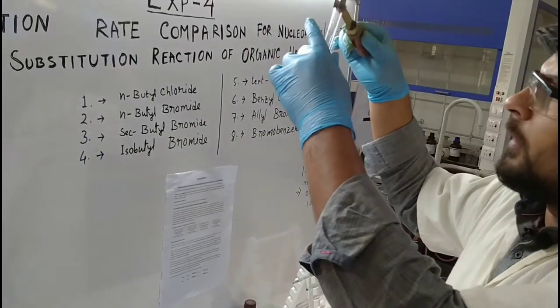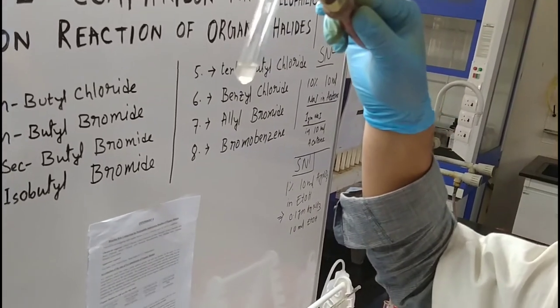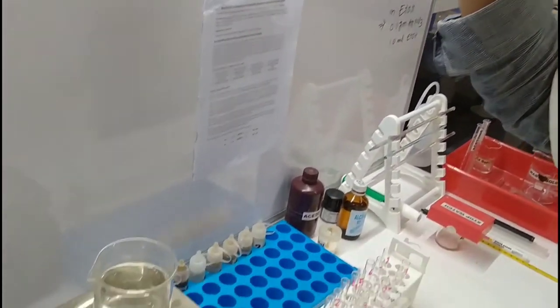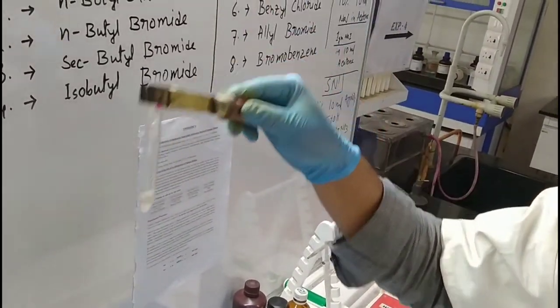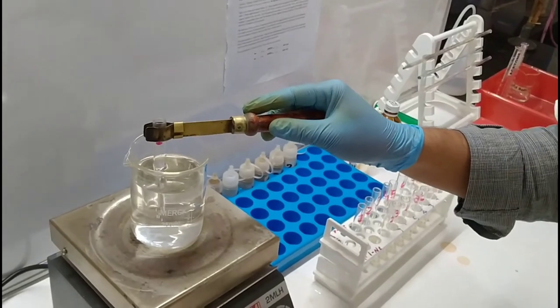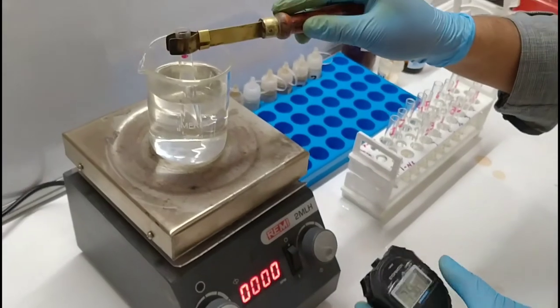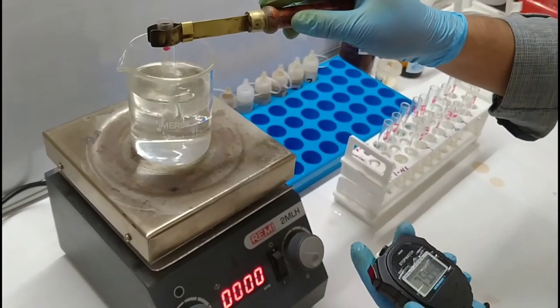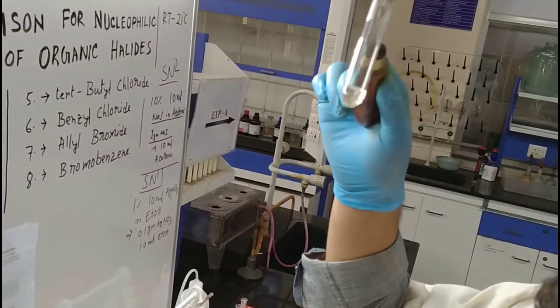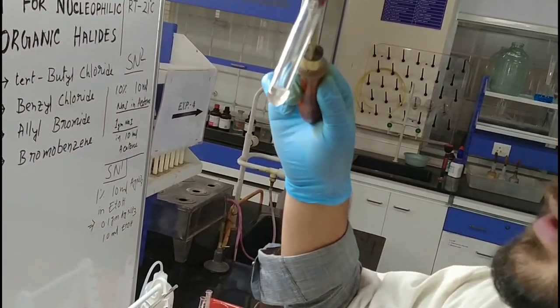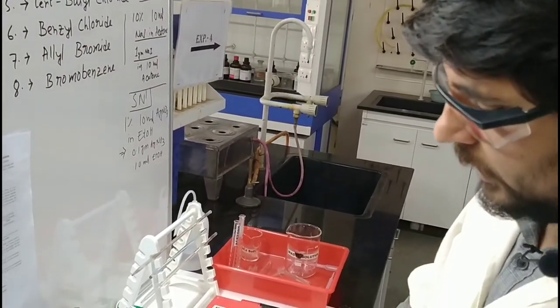The color of the solution changed a little bit from initial at 7 minutes 30 seconds, but still no precipitation — only color changed. 8 minutes completed, still no PPT, but only color changed. So our first SN1 experiment for the first halide is completed.